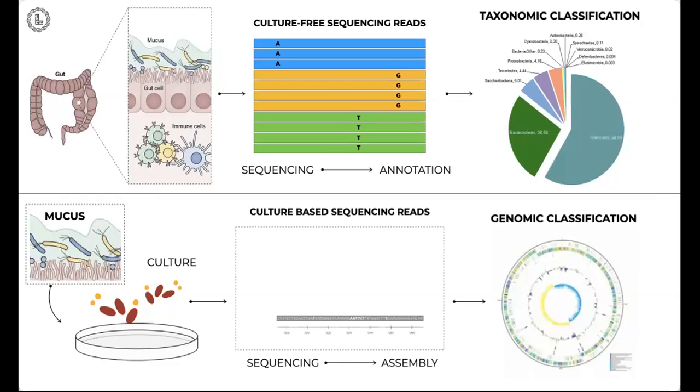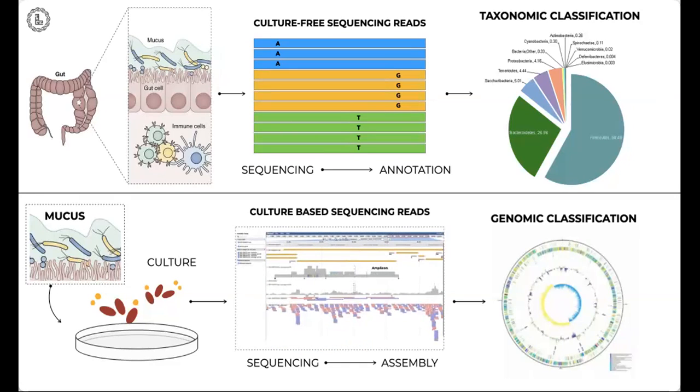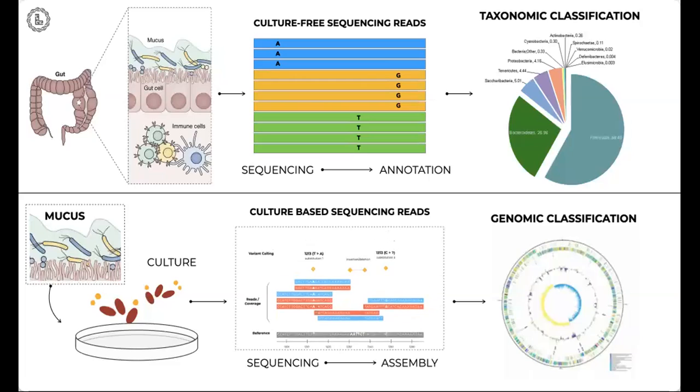This could lead to additional insights about the microbiome of our sample, for example, understanding antimicrobial resistance that can be characterized over several individual variants in the genome that we could be identifying from these comparative approaches.